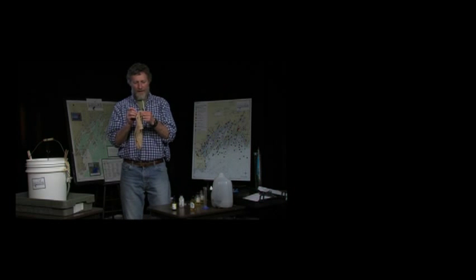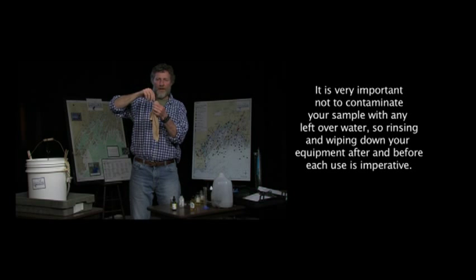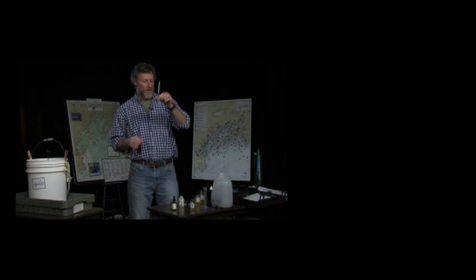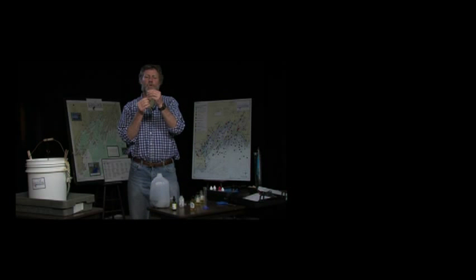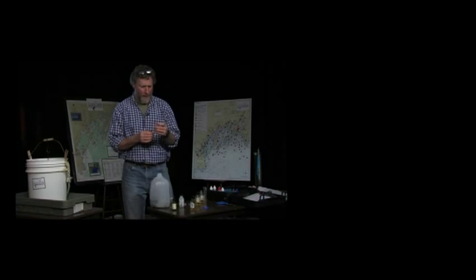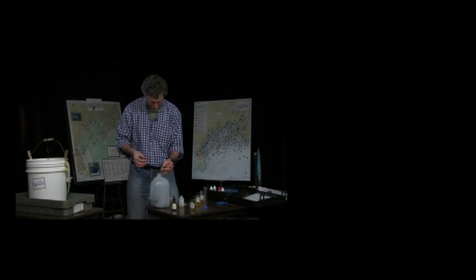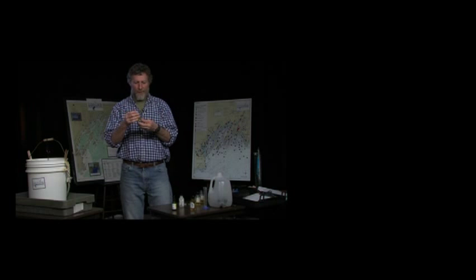You might also want to just take a towel and wipe the tip off. Since this was used previously, it may have had some of the sample water from the previous sample get around the tip of it. So that we don't contaminate our other test, we'll just wipe that off a little. We'll snap that on there. Now we need to make sure that we don't have any air bubbles in the tip, and we'll kind of slowly push the fluid up. And when we're confident that there are no bubbles, we will set the syringe at 0. And now we're ready to process sample number 2.